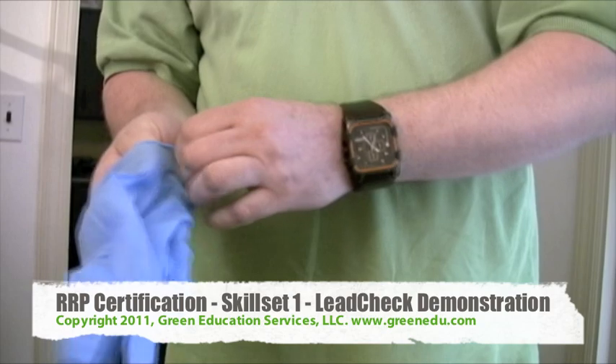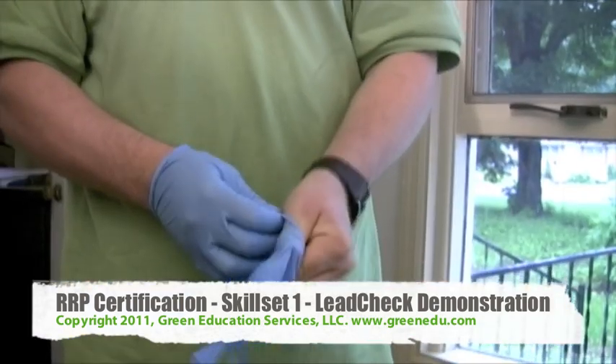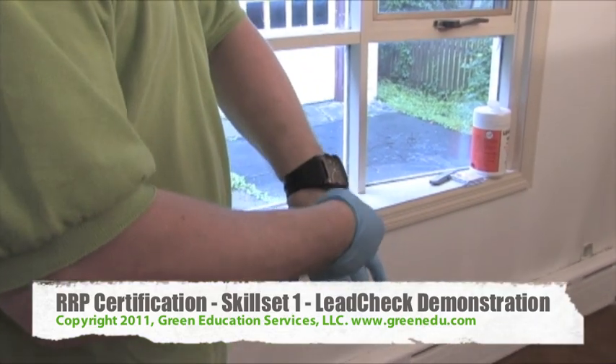Put on a pair of disposable non-latex gloves. You will be handling a test card that has a small concentration of lead. Disposable gloves are necessary for your safety.